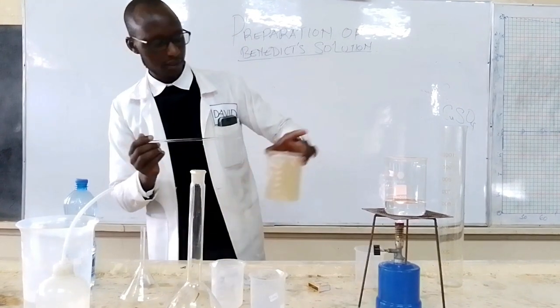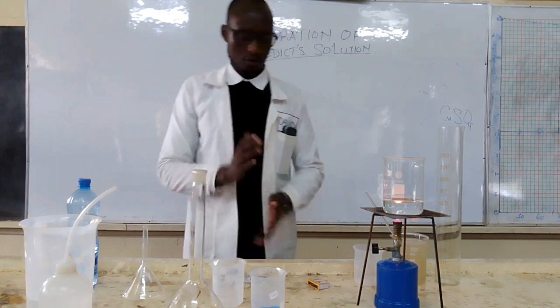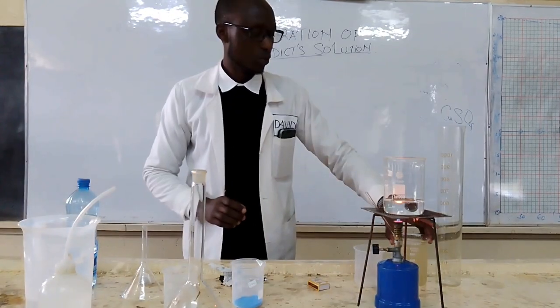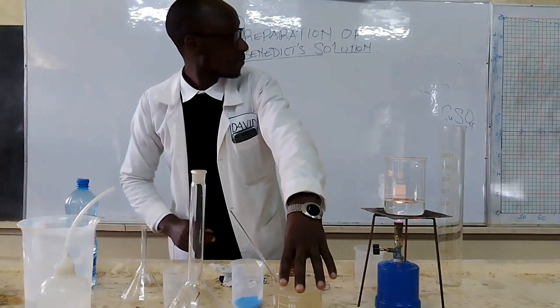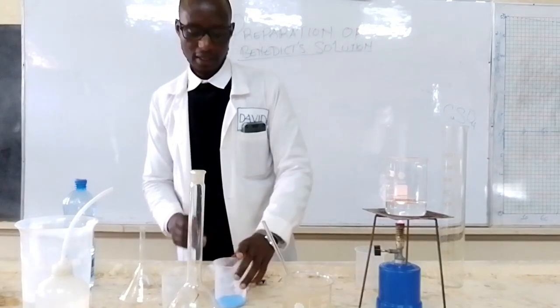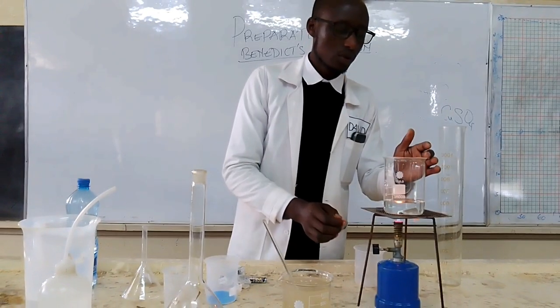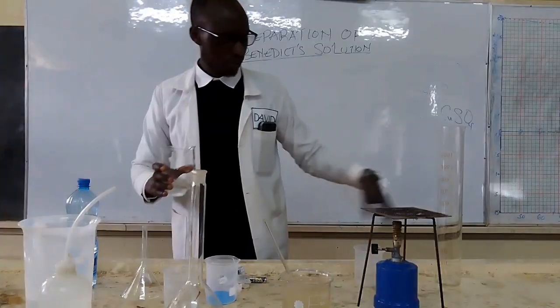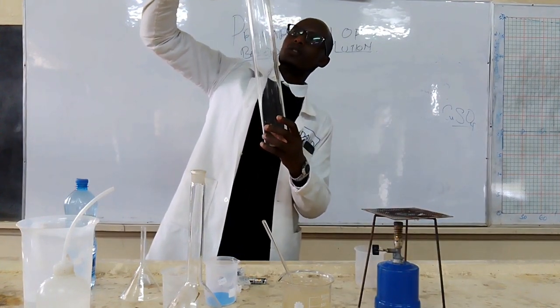So this one here is okay. This one has dissolved. Now we wait for the one for copper 2 sulfate. So remember, you mix the copper 2 sulfate, and the sodium carbonate and sodium citrate separately, and then prepare this one separately. So we are going to dissolve the copper 2 sulfate. So I'm going to use about 100 ml also of distilled water.